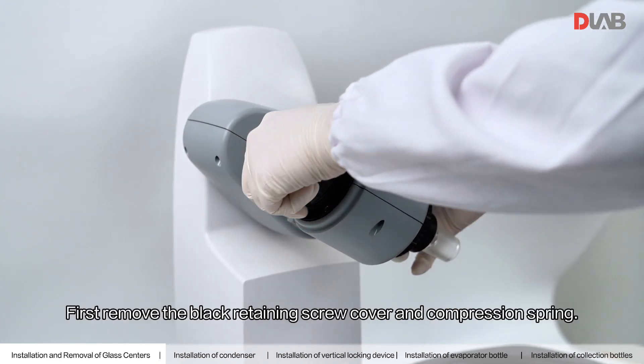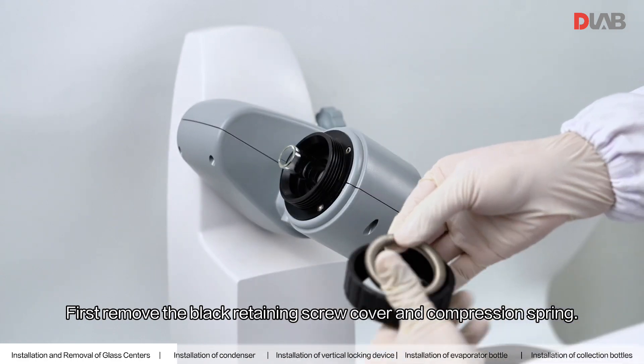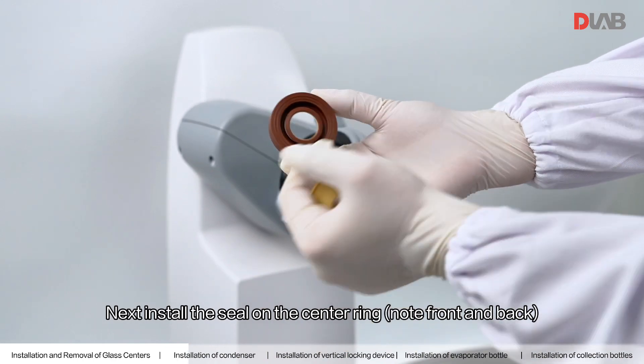Install the condenser. First, remove the black retaining screw cover and compression spring. Next, install the seal on the center ring node front and back.